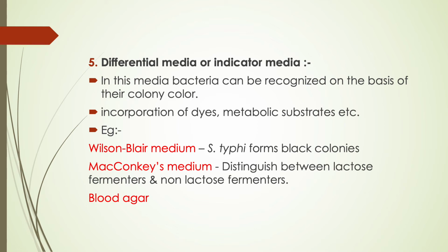So we have to add something in that media, okay, and because of the reaction between some enzymes or some proteins secreted from one bacteria, those proteins will react with something we have added in the media and it will give us a color.